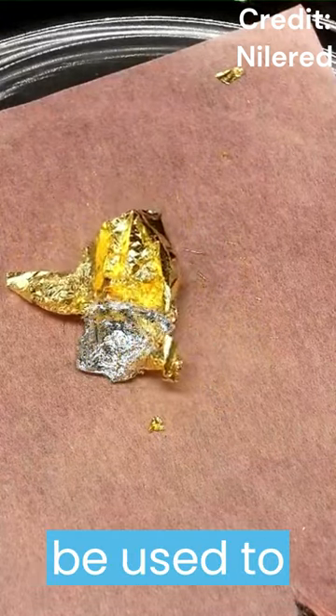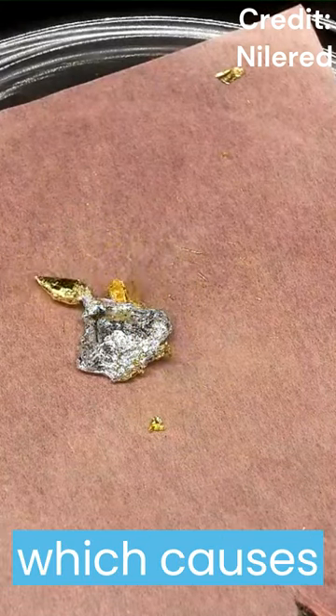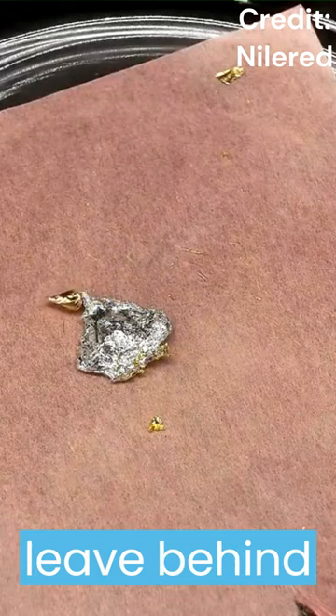This process can be used to extract gold from ores. The mercury gold amalgam can be separated by applying heat, which causes the mercury to vaporize and leave behind pure gold.